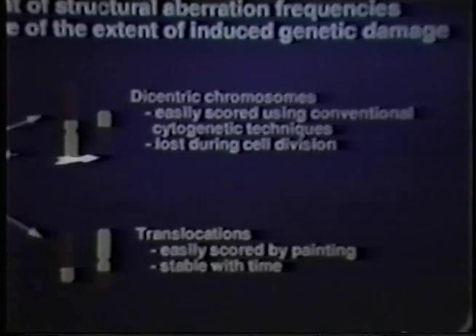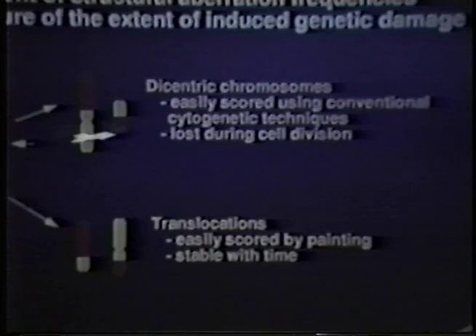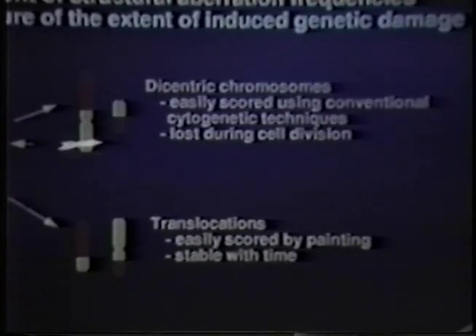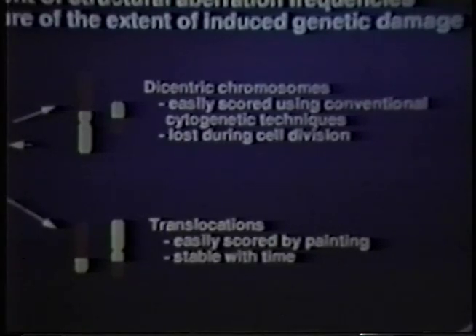The idea here is to stain some of the chromosomes using in situ hybridization, but not the others, so that you can see exchanges between stained and unstained chromosome types as these bicolor chromosomes. And it looks almost exactly like it does in this cartoon. Here you can see one of these bicolor chromosomes that was induced by ionizing radiation. You can see one part of the derivative stained chromosome here, and the other part located there.